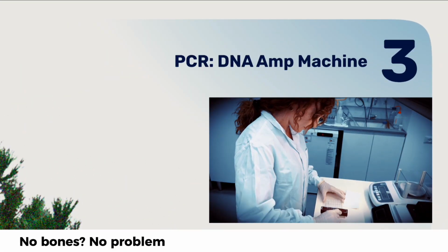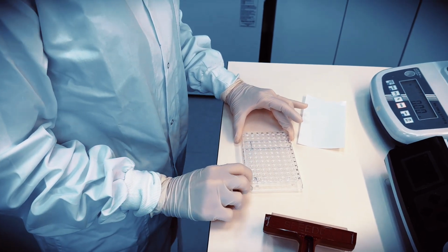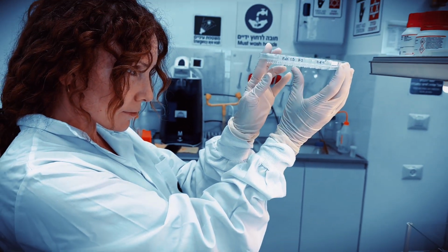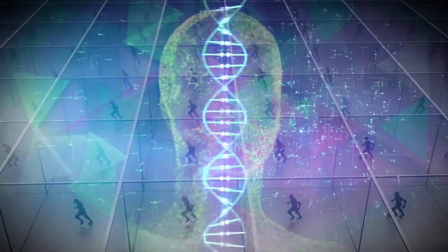Once the DNA has been extracted, it is converted into a DNA library, an organized set of DNA fragments that scientists can study. Scientists attach small artificial DNA fragments to each and every DNA molecule in their DNA extract, allowing them to copy and sequence these molecules later.